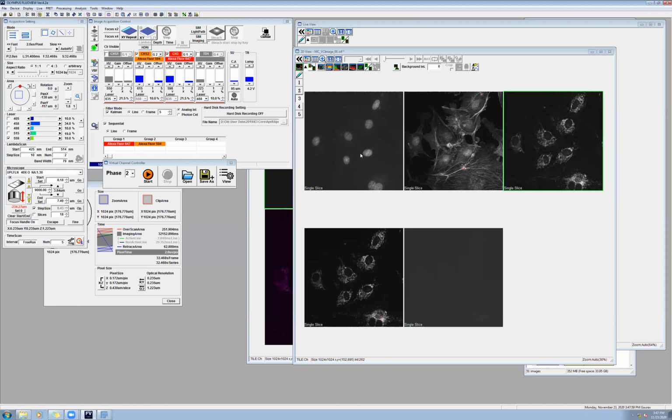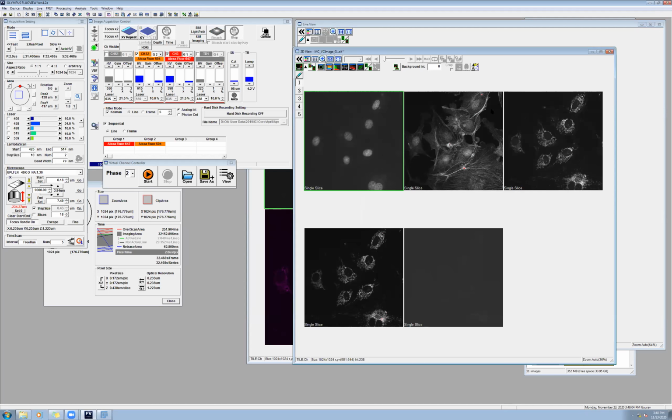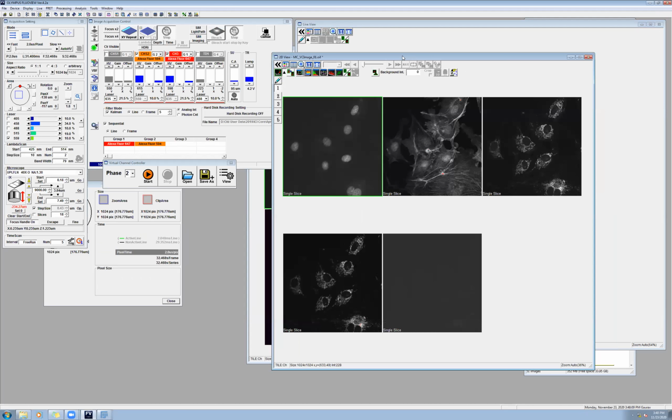So that's pretty much it. You can save the image the same way that I showed you earlier. Save as and get done with it. So that should do it for the virtual part of the training. Hopefully, when you come on Wednesday, you will be much more familiar with the outlook of the software. It won't be intimidating or scary for you, so that you can just jump in.